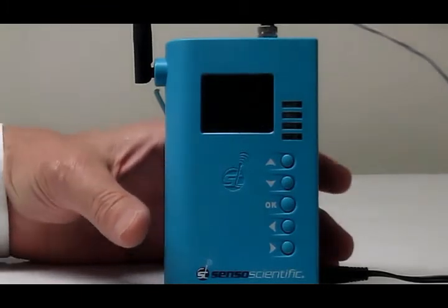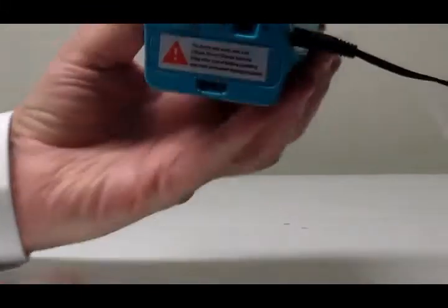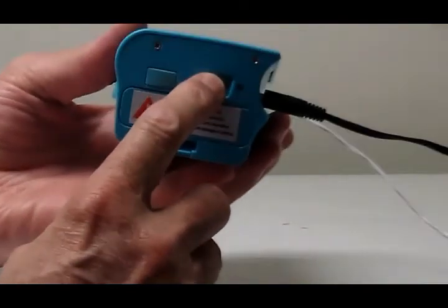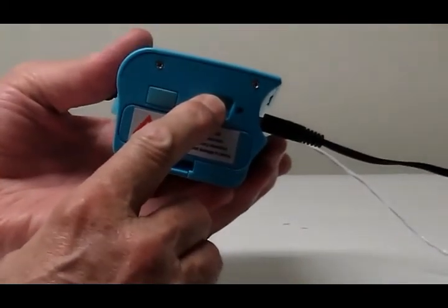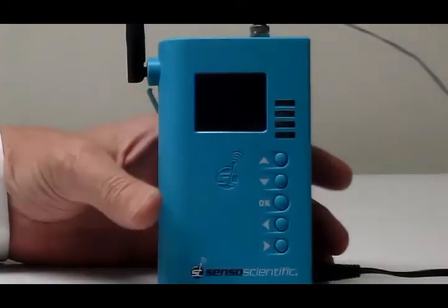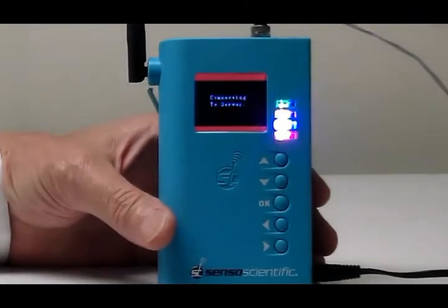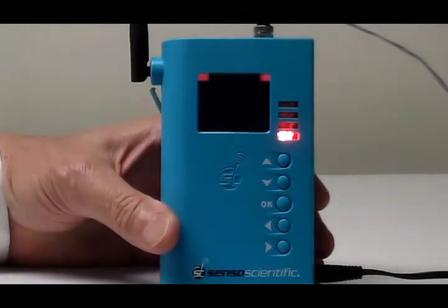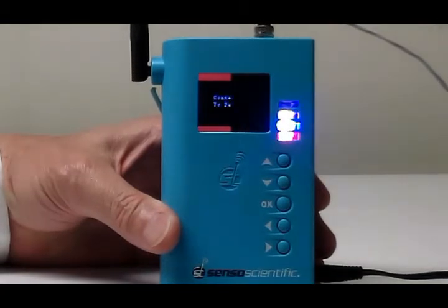Once the unit has been installed in the fridge, if you turn it upside down, there's an on off switch. If we turn the switch on from this position, you'll see that it will flash red. It says connecting to server. It's waiting for a few moments.